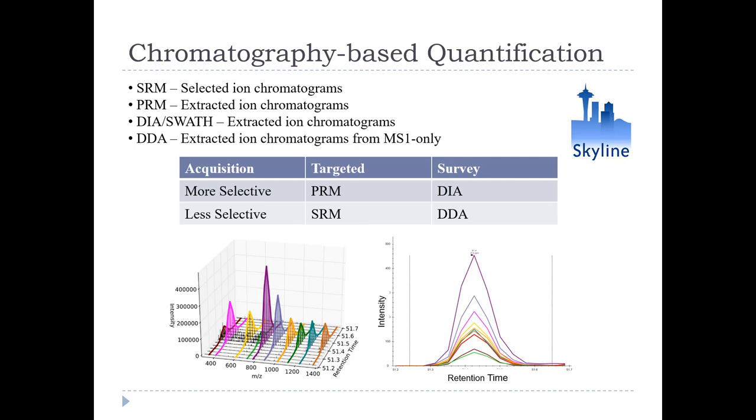it started with SRM, with the CPTAC study that Sue just described, and its first 3 years of funding came from that project, and it was all SRM until we decided, well, actually. I remember having a conversation with Mike MacCoss, my boss at the University of Washington, and I was like, wow, I think this Skyline thing is really pretty good for what it does, but it's a really teeny market, because we're one of the top SRM triple quadrupole proteomics labs, and we have one triple quadrupole, but we have like 5 or 6 other instruments in the lab.